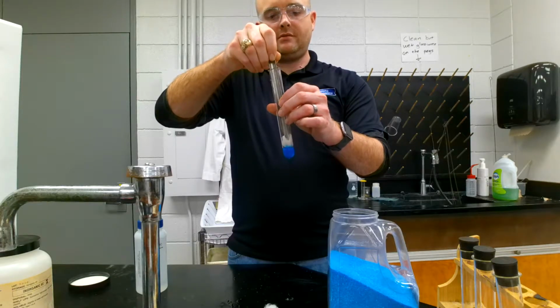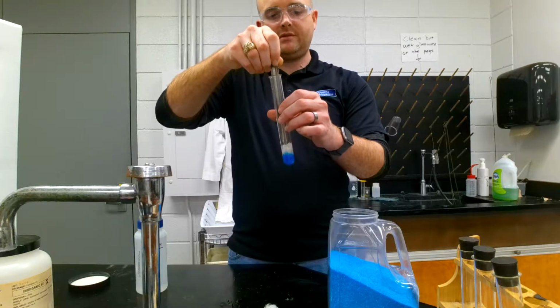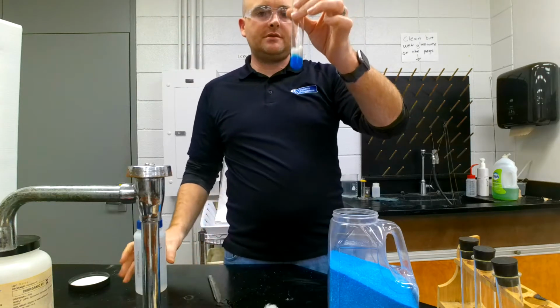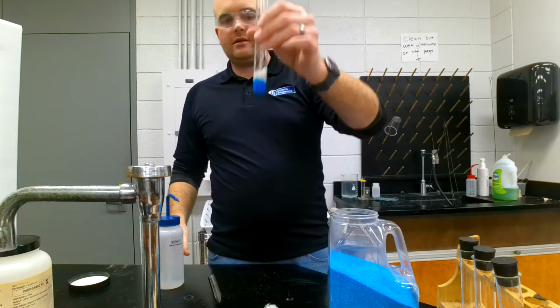And so my nylon ball or cotton ball is stuck in there. Maybe an experiment you could do at home if you have copper sulfate. And so just make sure there's enough water in it. Alright, there's enough.